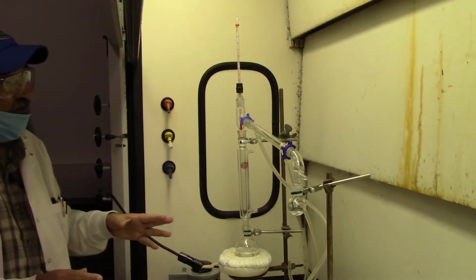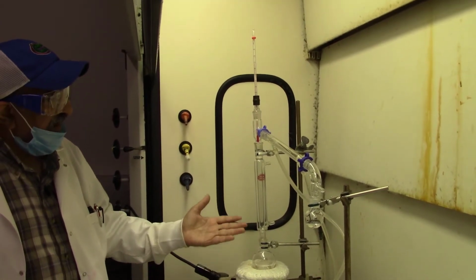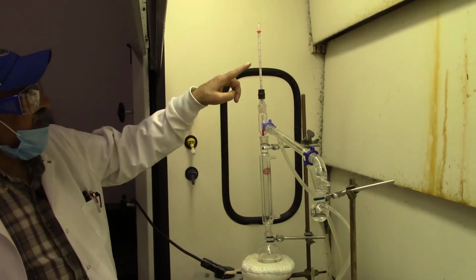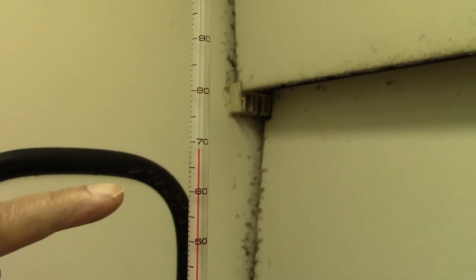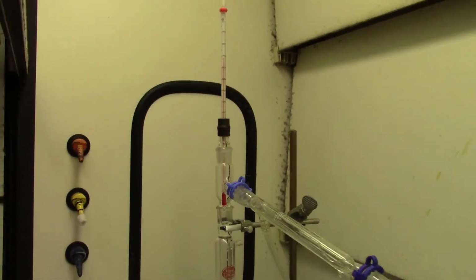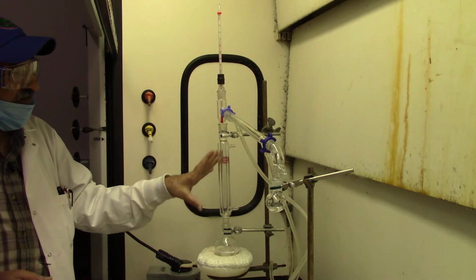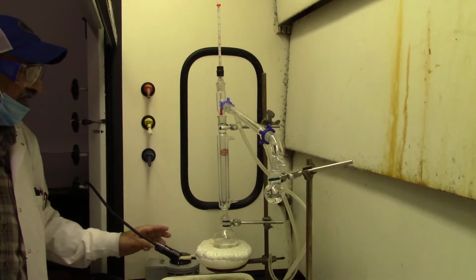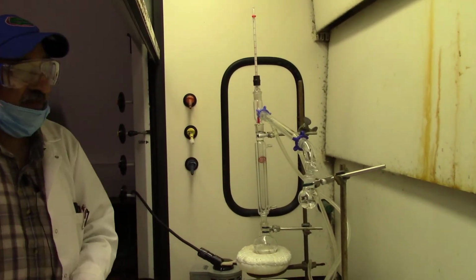Okay, it looks like our modification of interposing an empty condenser between the round bottom flask and the three-way connector worked really well. I can see the temperature is almost constant. It has been like that around 69 for a while, and so I'll collect the distillate between the temperature 69 to about 71 or 72, while keeping the variac temperature around 80, because it's really working really well.